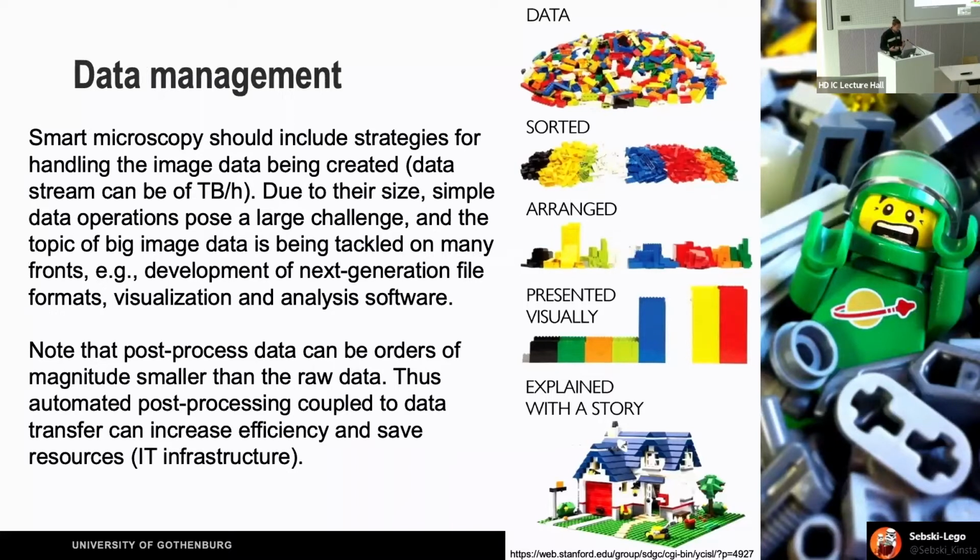And this challenge of big image data is being tackled on many, many different fronts. So there is, of course, the development of next generation file formats. We have, of course, new visualization and software tools and so on. And then the idea is that, especially at the facility, we don't want to just give the user access to, okay, this is a microscope, this is the pipeline, you get all the data, and then, have a nice day.